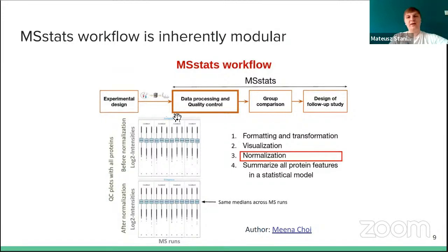And this is how MSstats packages were designed. So for example, in MSstats, we had converters, then the data process function, then the group comparison function. In MSstatsTMT, you'll see we have the converters, then the protein summarization function, then the group comparison TMT function.